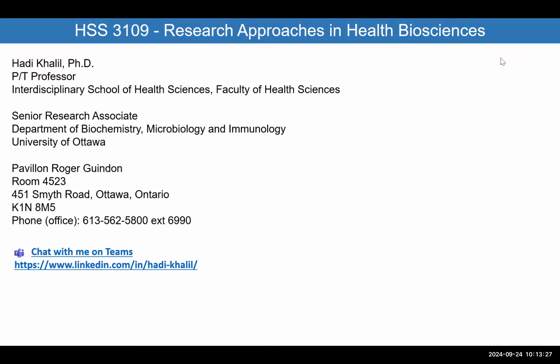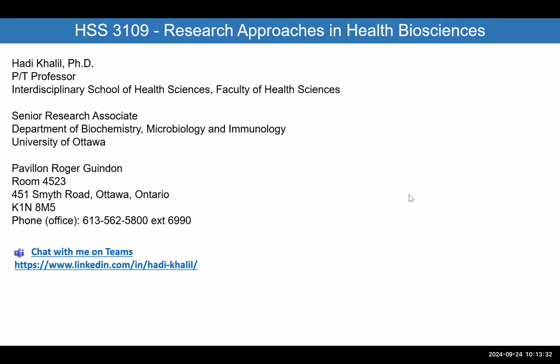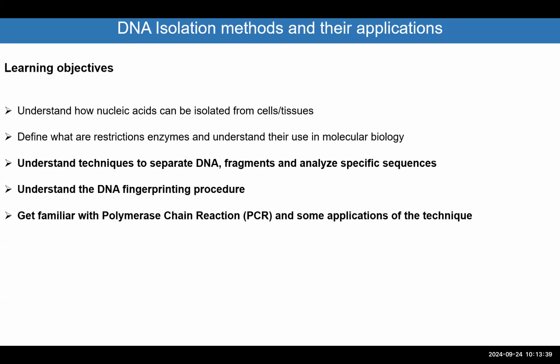Please remind me. Okay, so this lecture up till now, you can see we are building blocks bit by bit. We are able to culture cells, we are able to count cells, we are able to extract DNA from cells, and we are able to extract the whole DNA from those cells, so that we get the whole genome from those cells and look at it on electrophoresis.